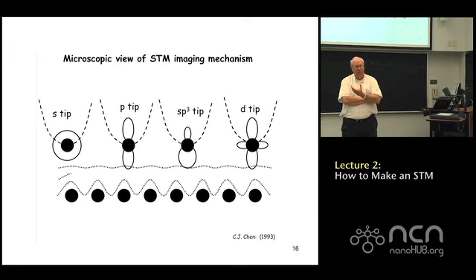If that atom is tightly coupled to the tip, then maybe the wave function associated with electrons in that atom are more like the bulk electronic states in the tip, right? So somehow adjusting the geometry of that tip atom allows you to adjust in some way the wave function that's present, that's appropriate. Now, it's a very inexact science, right?